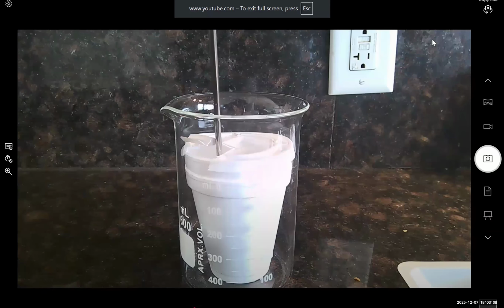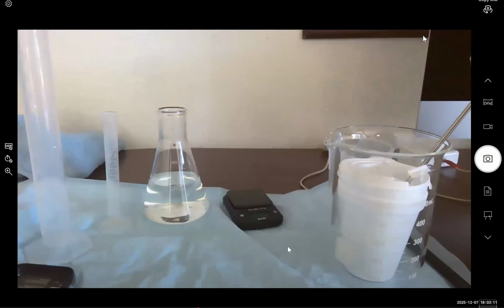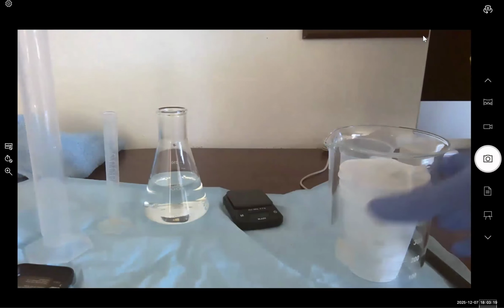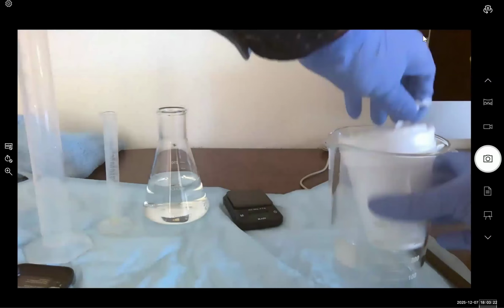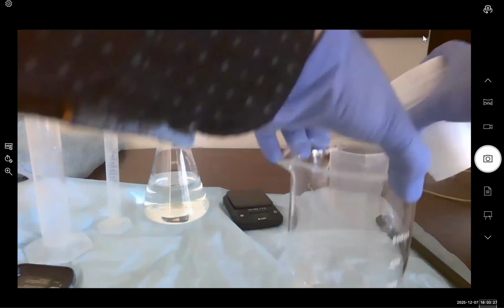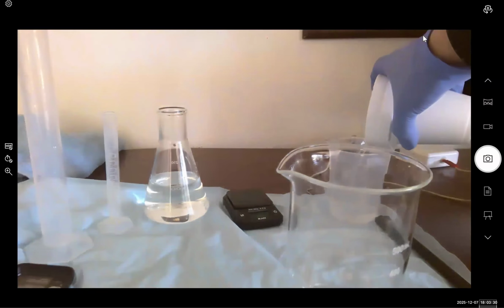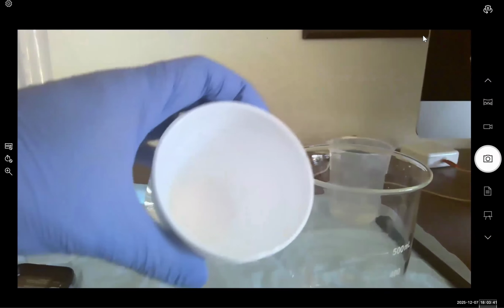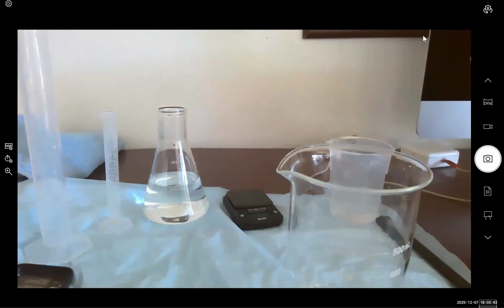Okay, so now, once again, I'm going to prep a new coffee cup calorimeter. I've emptied out my coffee cup calorimeter, and now we're going to prep a new set of water to fill in the coffee cup calorimeter. So I'm emptying out the old water that I used, taking out the metal piece, and now we're going to reweigh a new batch of water.